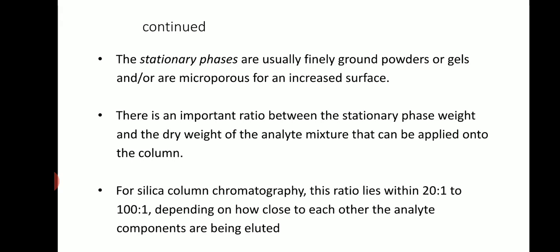The stationary phases are usually finely grinded powders or gels or micropores for an increased surface.